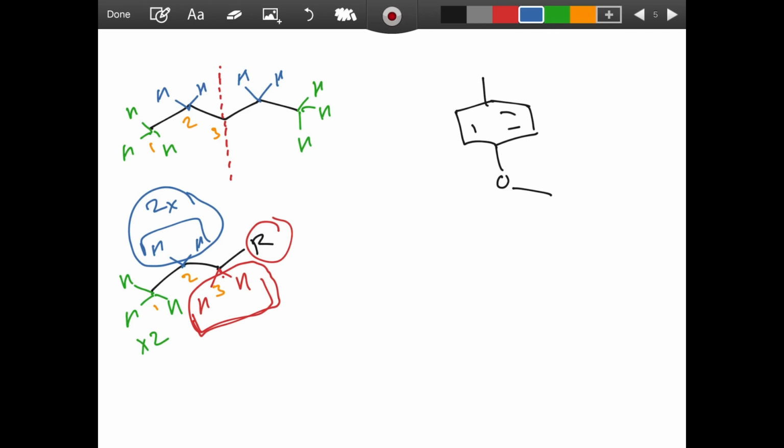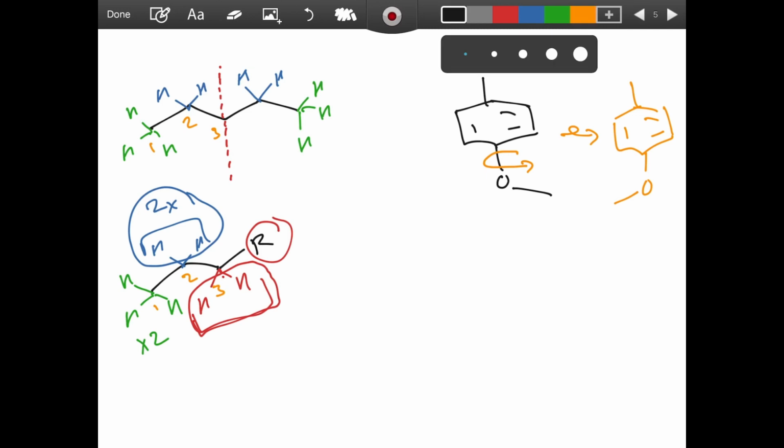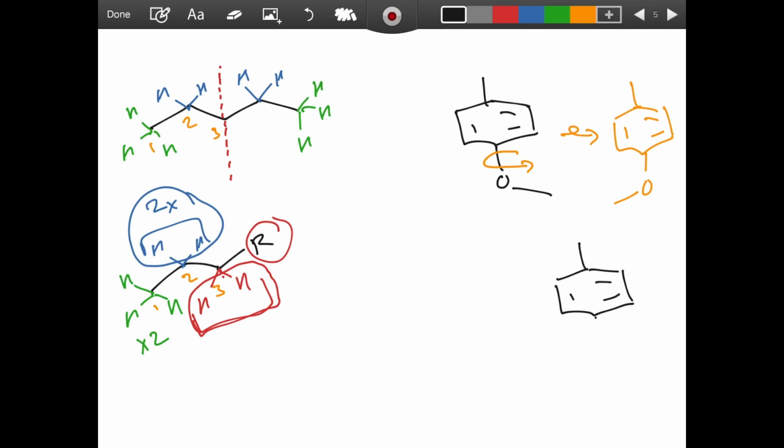If we look at an aromatic ring, like we have over here next, what tricks people is there is a plane of symmetry, right? So remember that single bonds can rotate. So this is going to rotate around. And as far as the NMR is concerned, this kind of ends up averaging out. And this molecule, kind of like meso compounds, if you could draw one isomer that is symmetrical, then we consider all the isomers or all the conformations to be symmetrical.